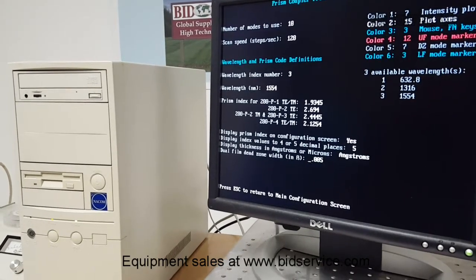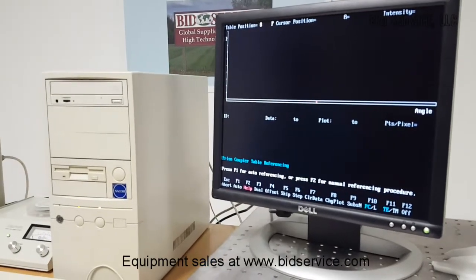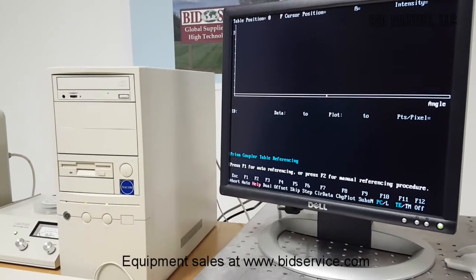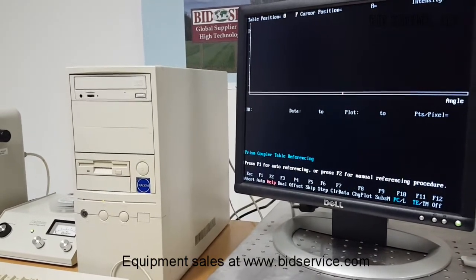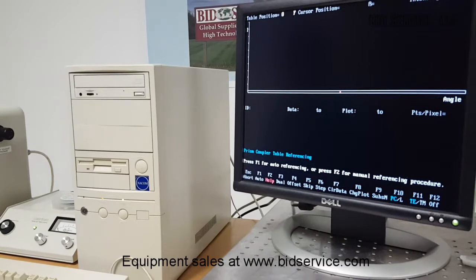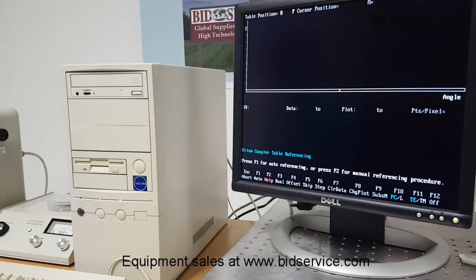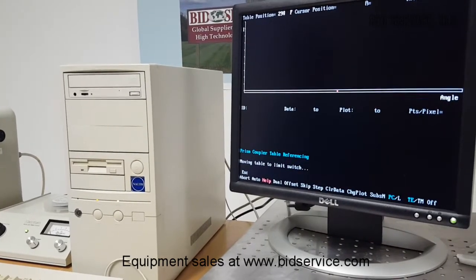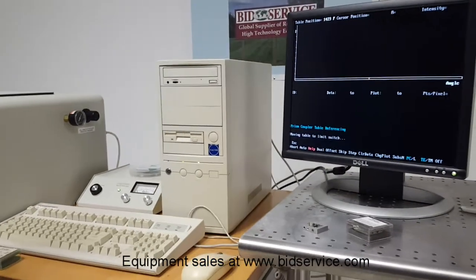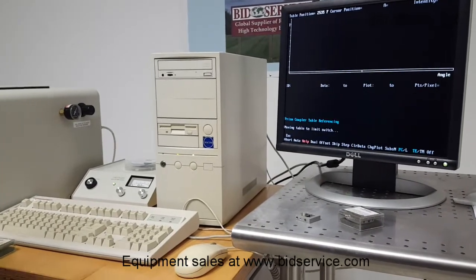Once all the parameters are entered, the escape key will bring you back to the previous screen, and again escape will take you back to the main screen. In this mode, once the data is entered, we have to do the referencing. The unit will find the angle of the laser. Here we press F1 for auto referencing. At any point of time during or after the measurements, in order to switch back to the reference measurement, press the Home key on the keyboard and it will take you to the screen.